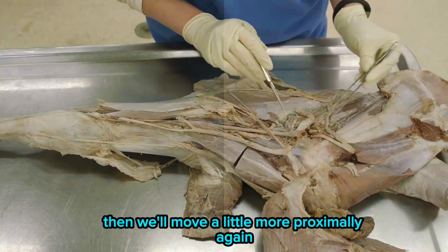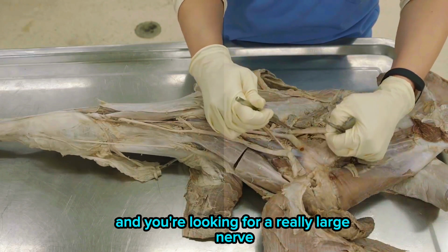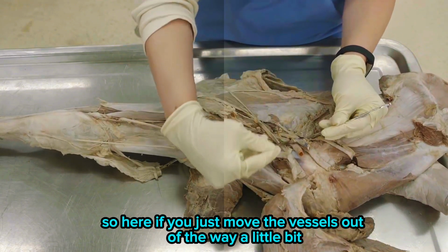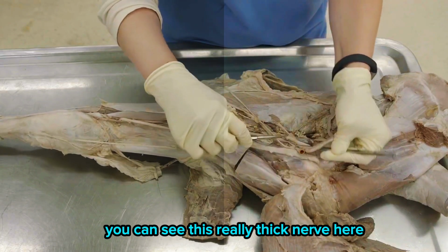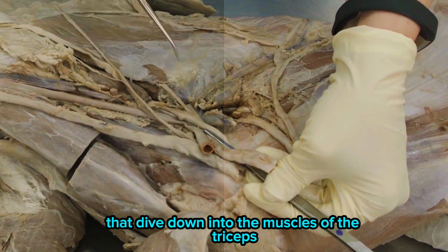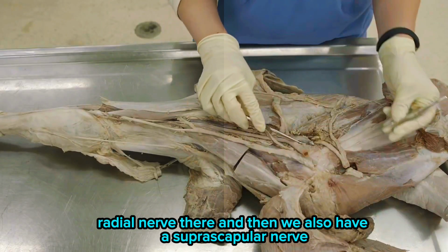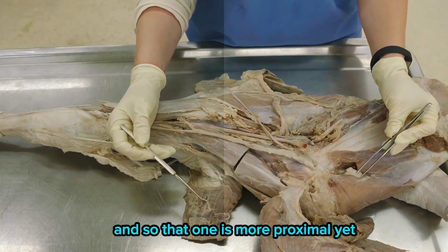Then we'll move a little more proximally again, and you're looking for a really large nerve, really big and thick. That will be your radial nerve. If you move the vessels out of the way a little bit, and I'll try and elevate this, you can see this really thick nerve here, and it has all of these branches that dive down into the muscles of the triceps. Triceps brachii is this muscle mass back here, and all these nerves dive in there. That's the radial nerve.